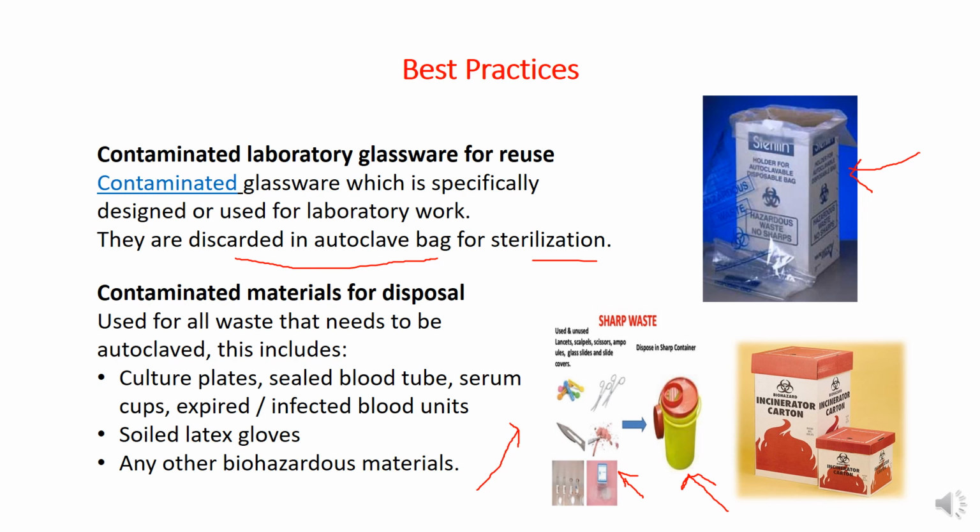Of course these should be autoclaved and stored in particular bags, and then of course disposed of. So be careful about these, because it is really important to segregate this contaminated garbage from the non-contaminated.